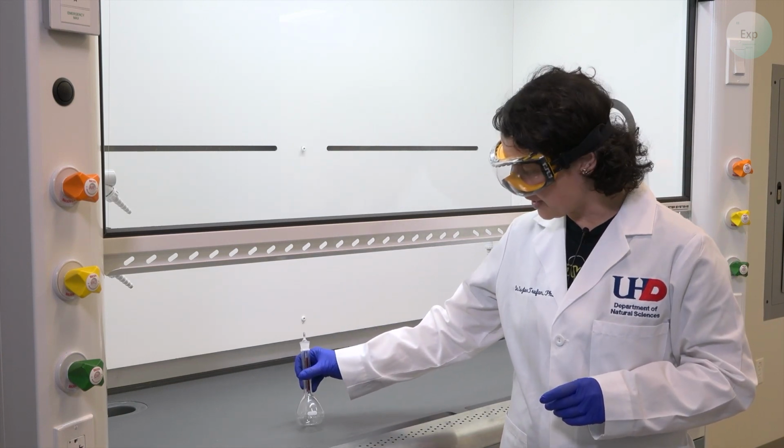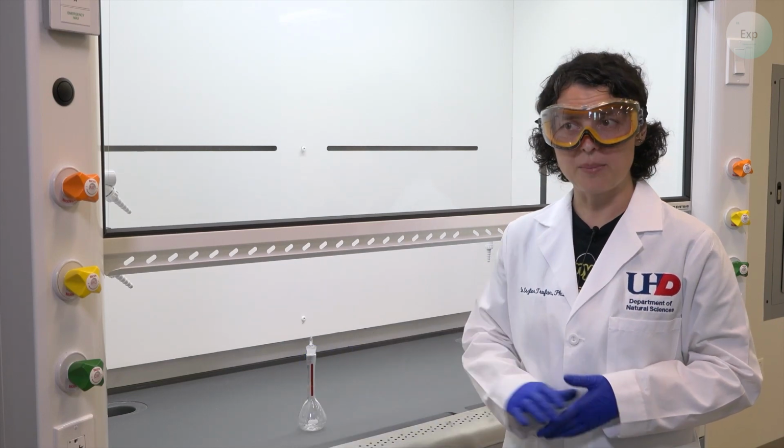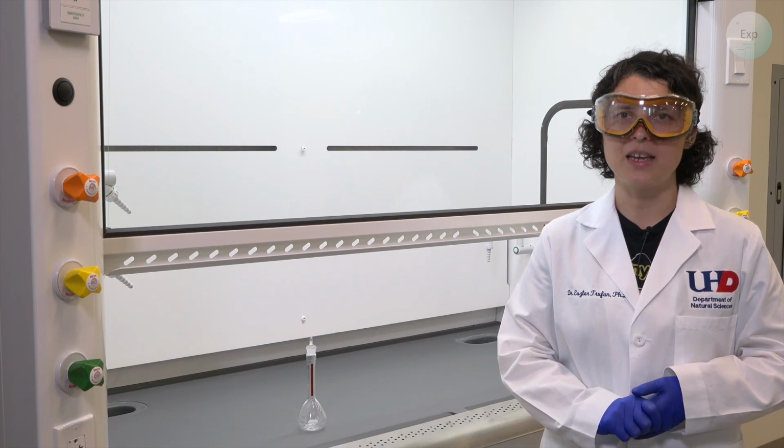And we know that this is the right vessel because it says so on it. And it's a volumetric flask because it has the shape of one. For the experiment, we're going to need some glacial acetic acid and some deionized water.